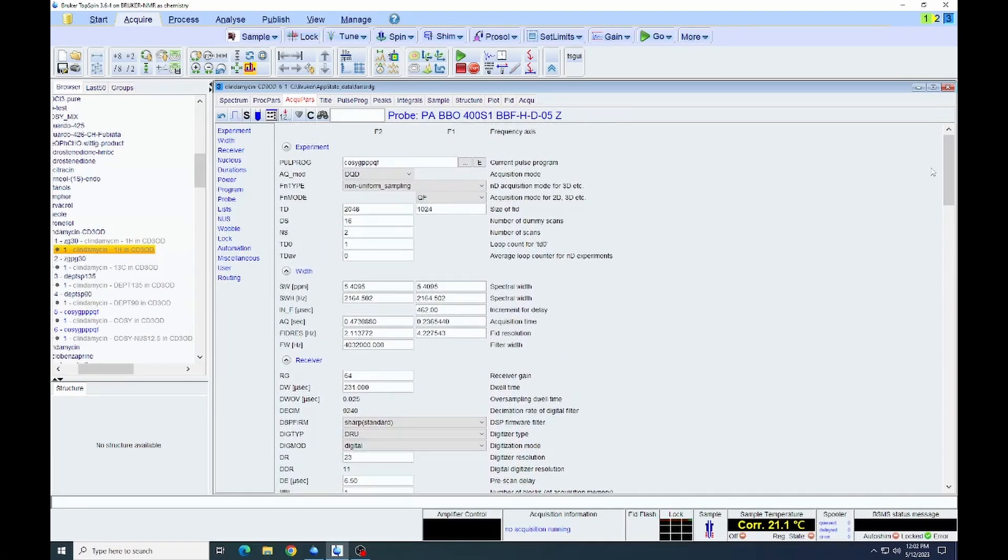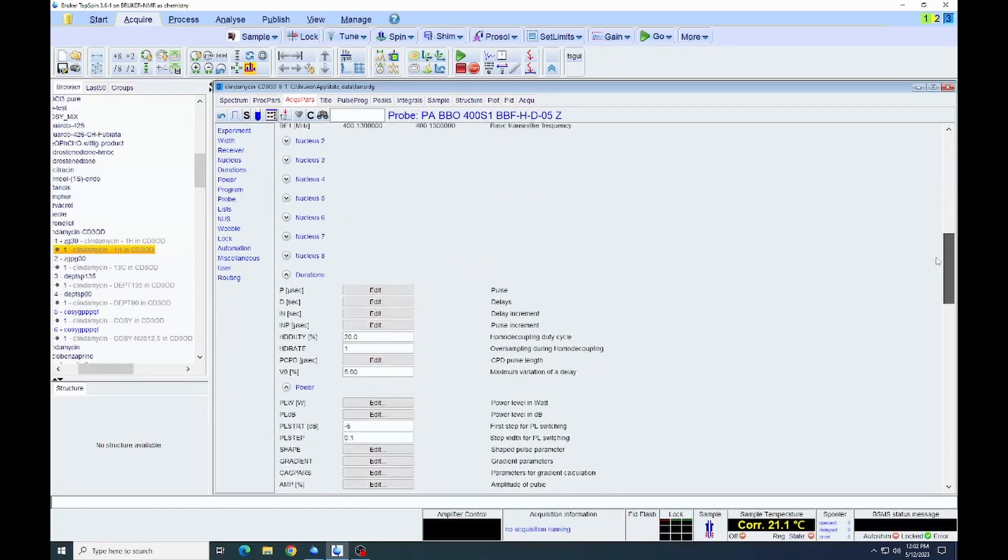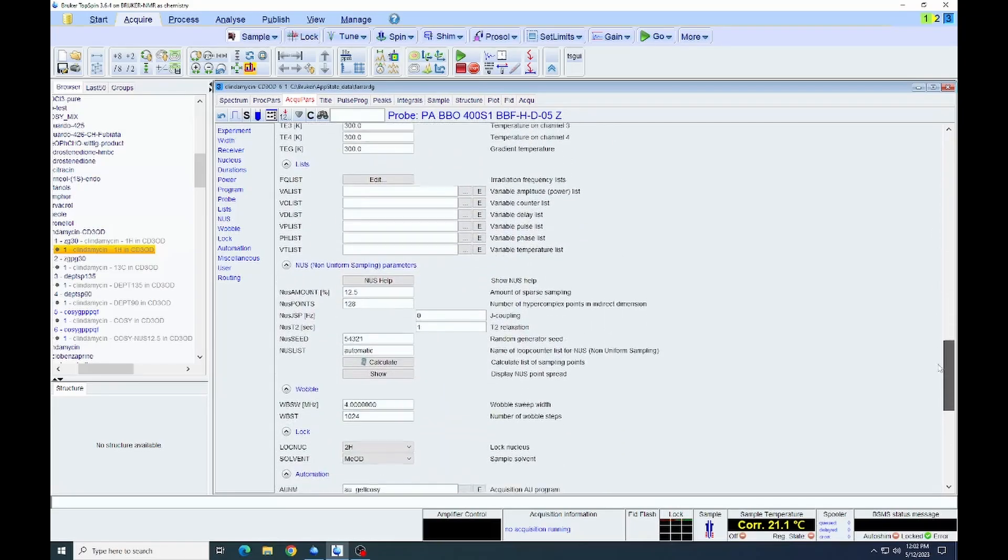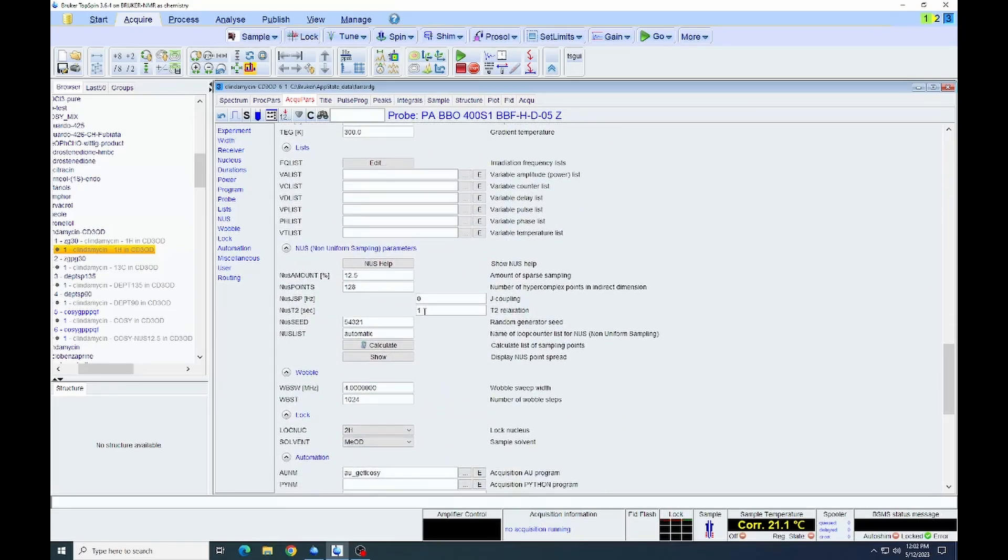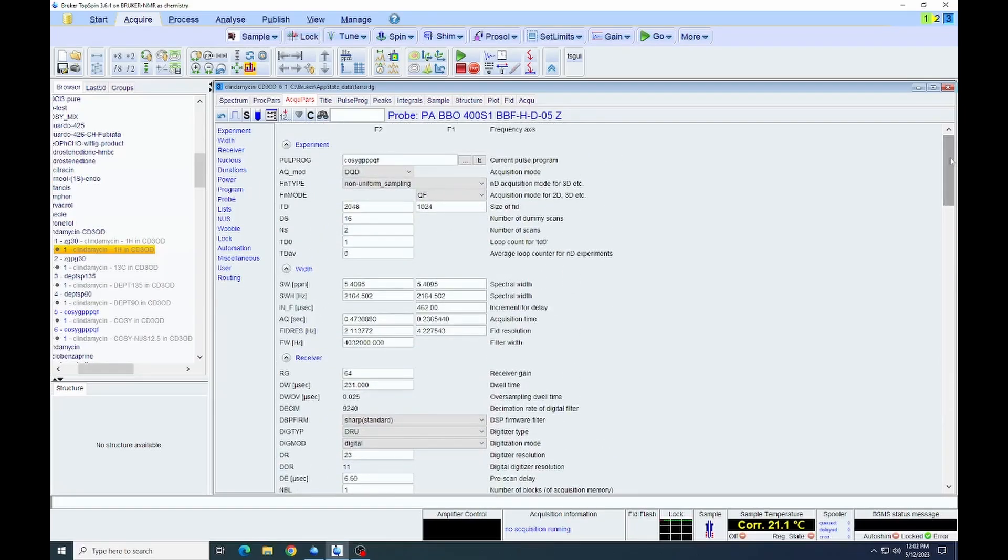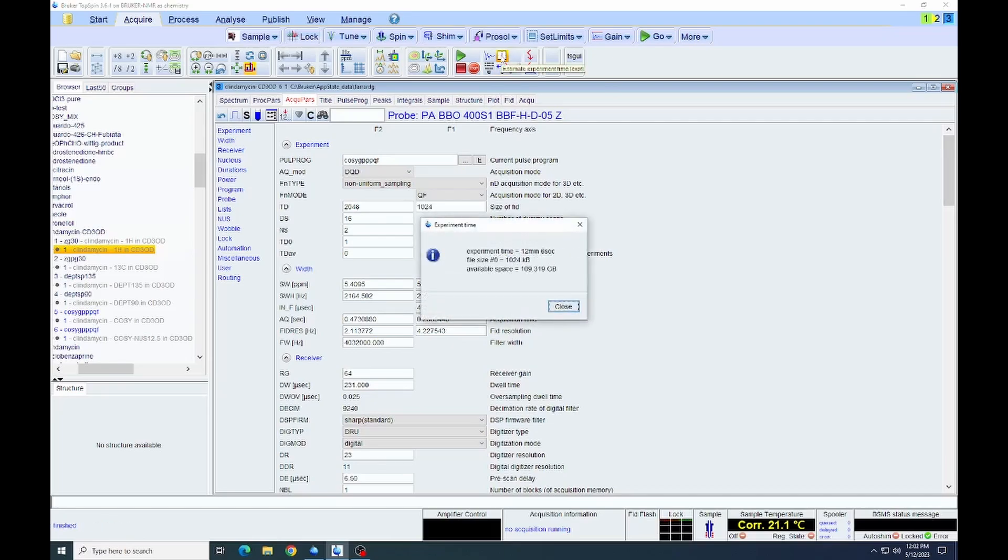Something to note here is the acquisition time, the aq in seconds for FN1. That's about a quarter of a second. Need to make note of that time. We will use that down again in the NUS parameters when we set the T2 relaxation. We set it basically to be approximately equal to the acquisition time in the indirect dimension. We can estimate the time for this experiment. We can see it's about 12 minutes or so.